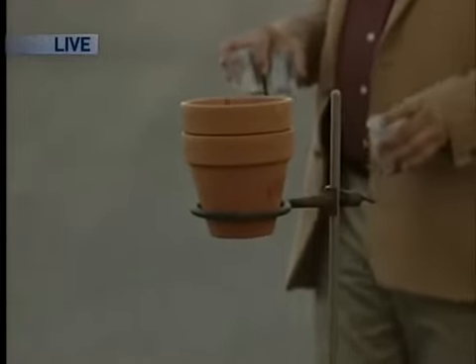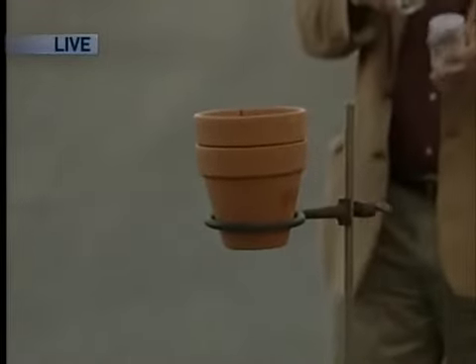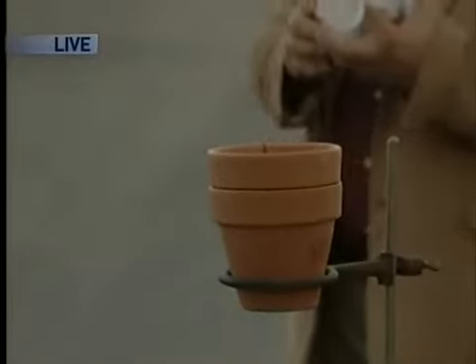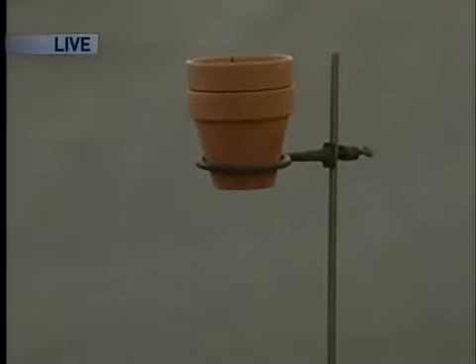You don't really want to go up and touch it because you're afraid it's going to go off in your face. And so I'm a little concerned that it's not smoking. I'm going to get some more glycerin. Okay. Just a second. We'll babysit it. You can babysit it. I'm hiding behind the fence. I know, you went all the way behind the vehicle. There we go. Okay. All right.